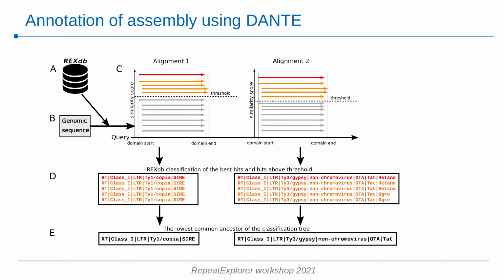The DANTE pipeline utilizes protein sequences from the RexDB database to annotate protein coding sequences in a transposable element in either contigs or whole genome assemblies.